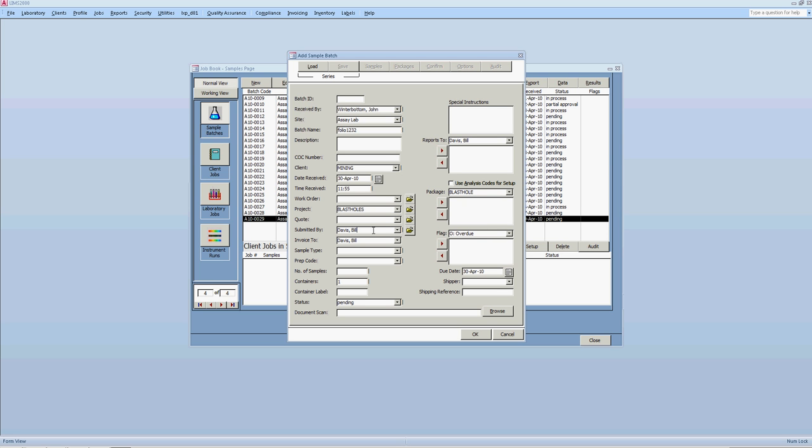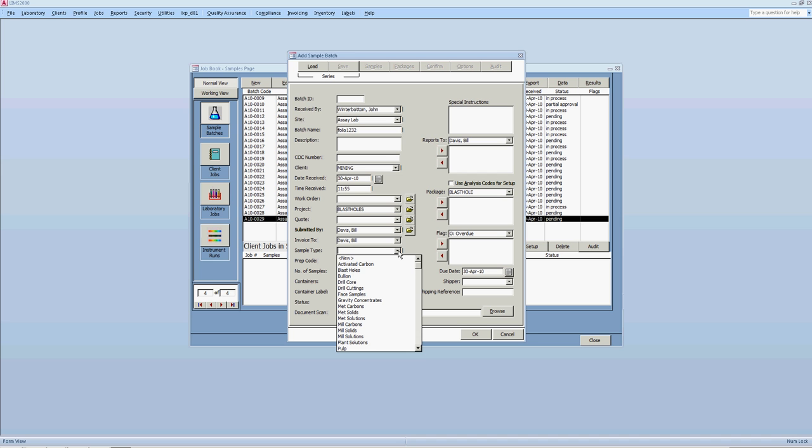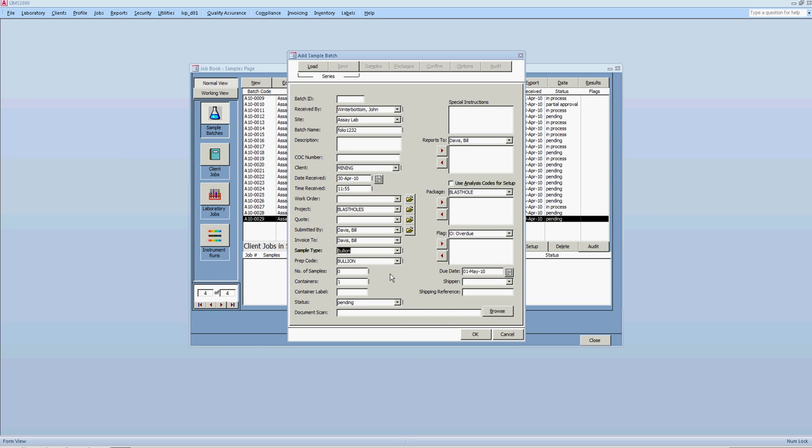And then we'll put submitted by the person. It automatically brings the first person in the list under that client. Oh, okay. First person on the list that's shared. Okay. Yes. And then the sample type is something that's mandatory? Yes. That has to be selected from the list. And if the sample type is not there, there is a new menu where you can enter the new type of sample.